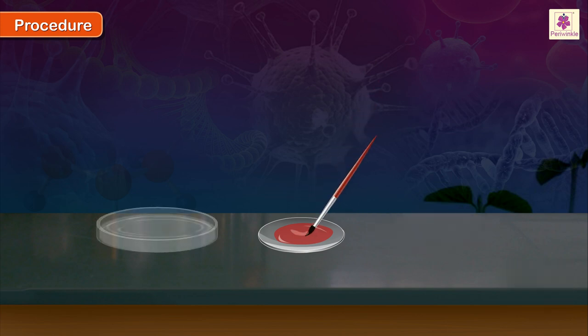Use the brush to transfer the stained peel to the petri dish. Use a clean brush to transfer the stained peel to the center of a clean, dry, and blank glass slide.